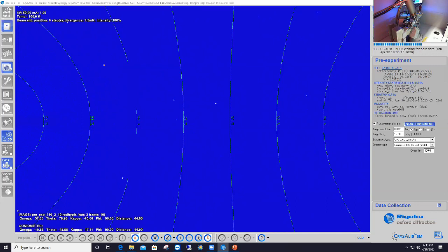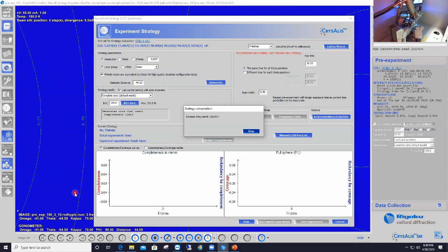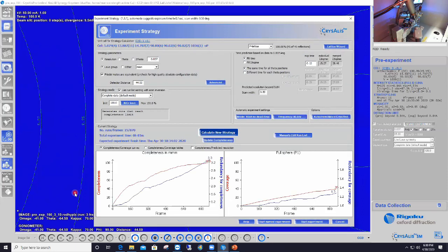The goniometer is moving again here, setting up a 3rd crystal orientation, and then data are being collected in that 3rd orientation. So there it is, 10 images were collected in that 3rd orientation. So the pre-experiment here collected data in 3 different crystal orientations, and for each crystal orientation, or for each run, 10 consecutive images were being collected.